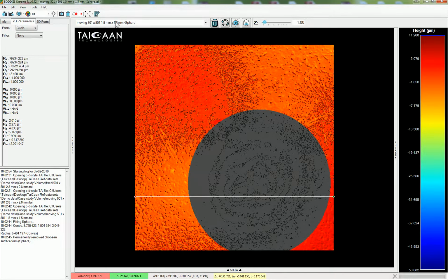And if we just replace back in the data, coming back to the data selection, there's a little arrow here which I'm just highlighting, and here you've got the round brush, square brush, the size of the circle, which is currently 1.08 millimeters, and I'm now going to include all.